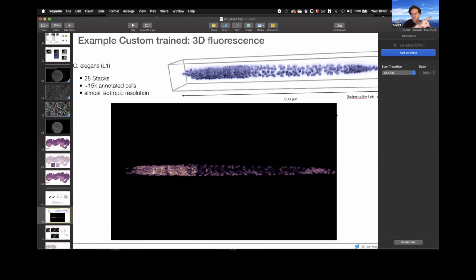So you would use it as a plus or minus 10% outline of the cell. You'd use that, maybe get the probability mask of foreground and background, and expand it slightly according to this probability map. That would be my recommendation for these kinds of situations.